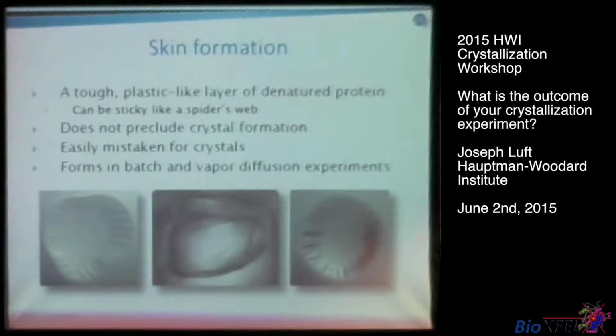It can be like a spider web to try to tease away from your crystals. It can be very tough, literally like saran wrap, where you have to sort of pick it away with acupuncture needles or something to get your crystals out.